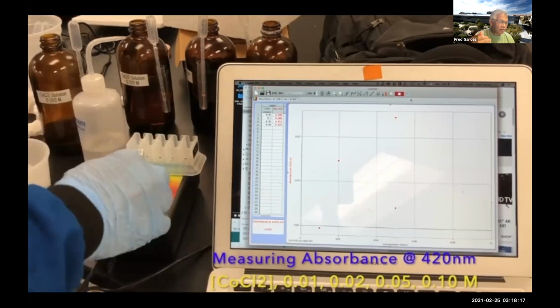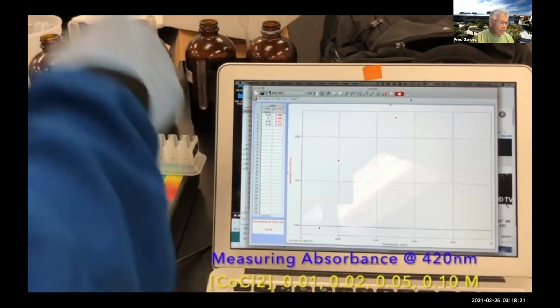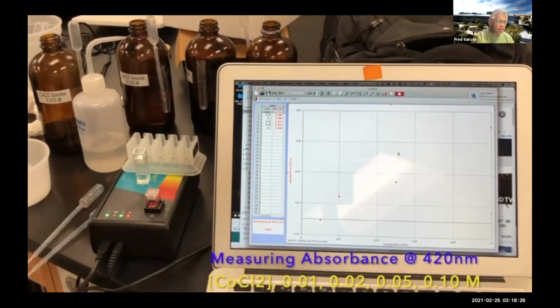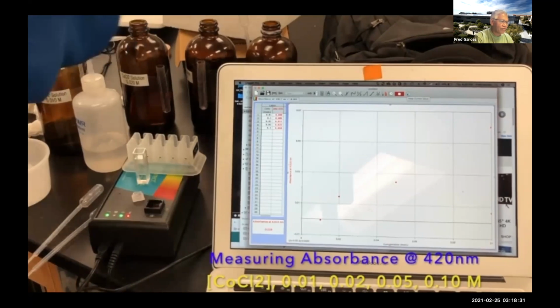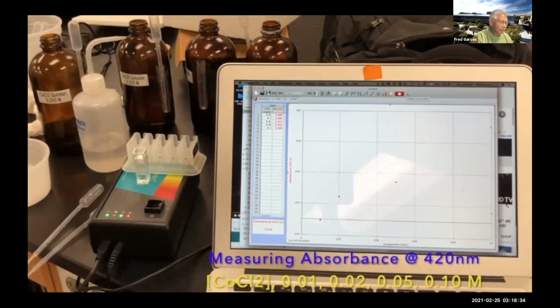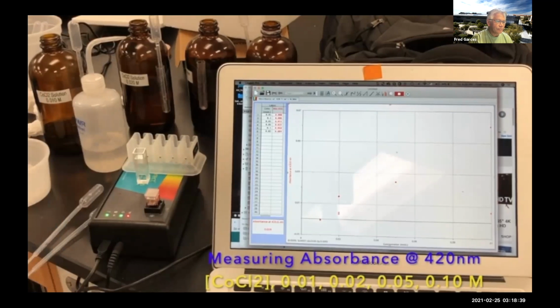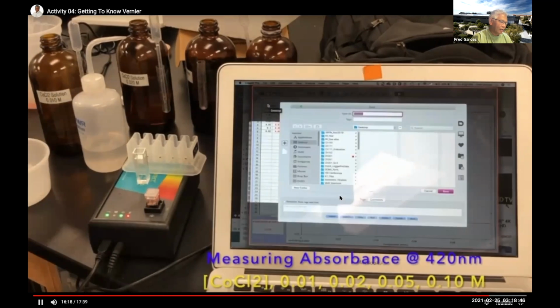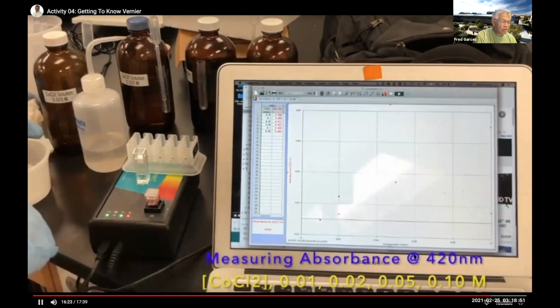and these are the different absorbances that are going to happen per solution with different concentrations. So if you look at this right here, you guys are going to see, again, I'm putting in the concentration, and then the instrument's putting the absorbance in this graph, and I'm generating hopefully a straight line. That's the last. Here we have it: 1, 2, 3, 4. I think I have to do this again because that was off. So that's what the experiment shows you.